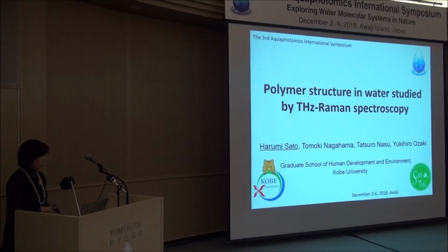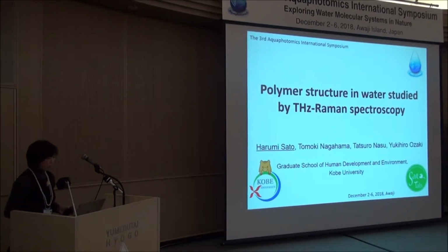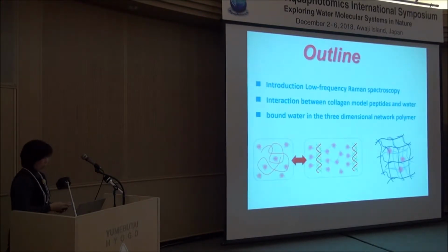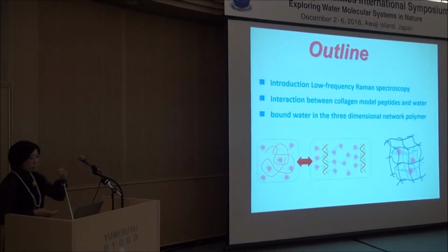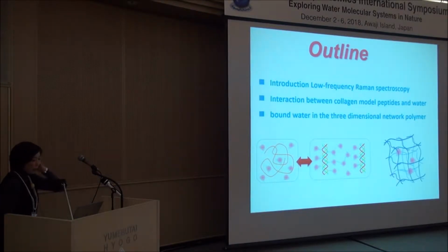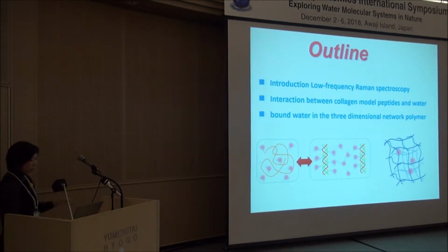And today, I would like to talk about polymer structure in water studied by THz-Raman spectroscopy. This is an outline of my talk today. Firstly, I'd like to give a brief introduction of low-frequency Raman spectroscopy for polymer research. Then I will talk about hydrogen bonding between collagen model peptide and water. And finally, I'd like to talk about 3D network polymer and water interaction.